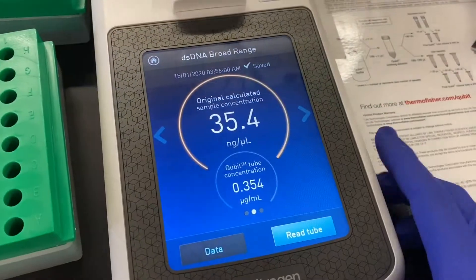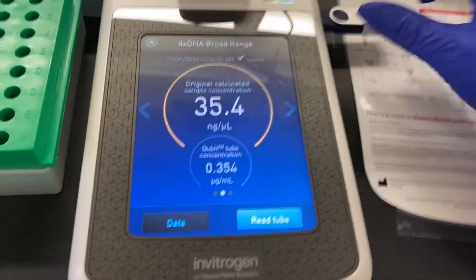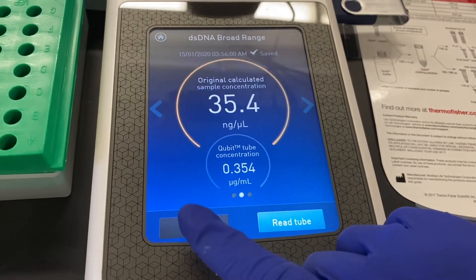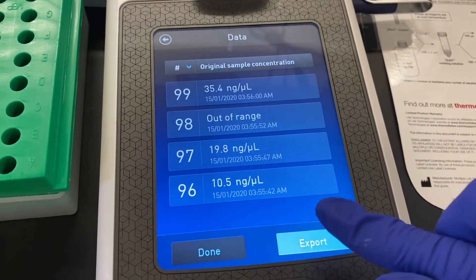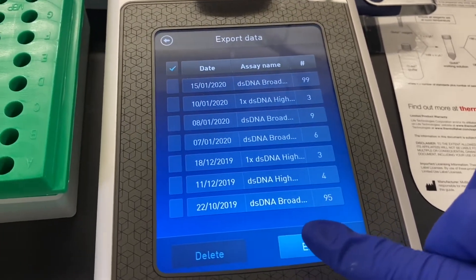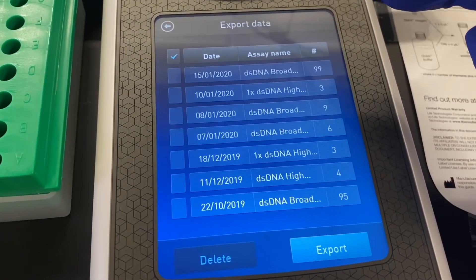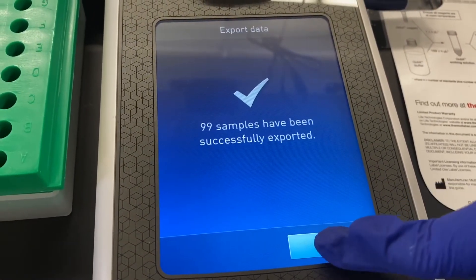Once all your measurements are complete you can export your data through the USB port on the side of the instrument. Just plug in your USB, hit Data, Export, and then select the assay from that day. Export and you're done.